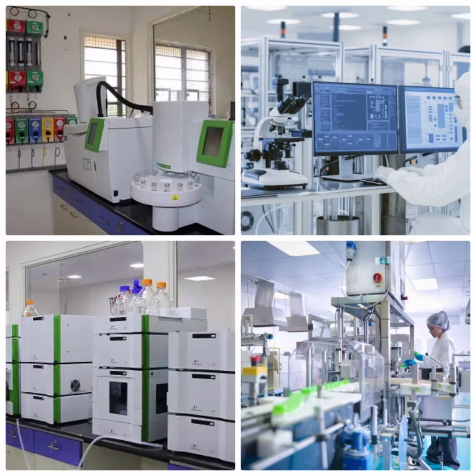Since GC separation is based on compound volatility, similar molecular weight can result in comparable retention times and cause the peaks to overlap. In the same way, the polarity of molecules affects resolution in HPLC, and so does the composition of the mobile phase.